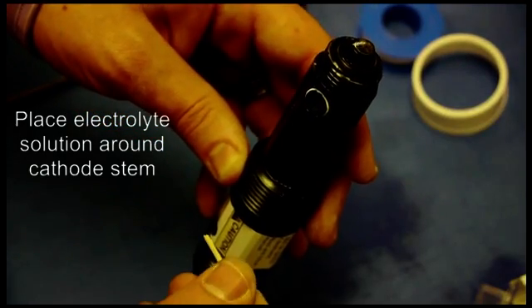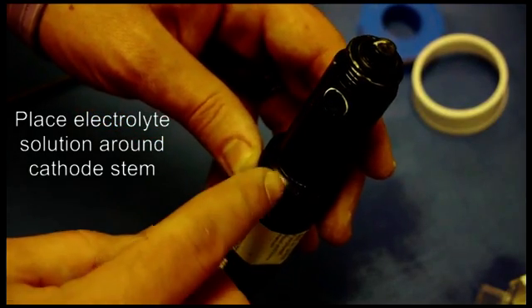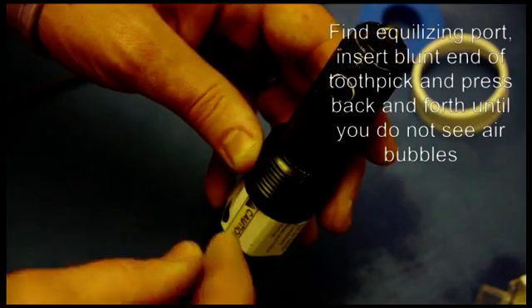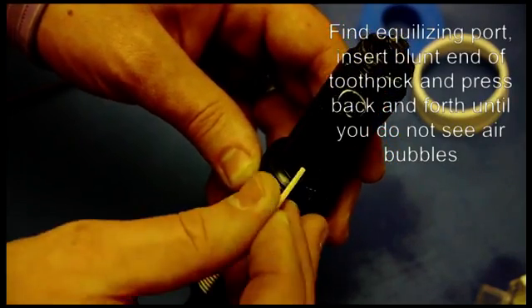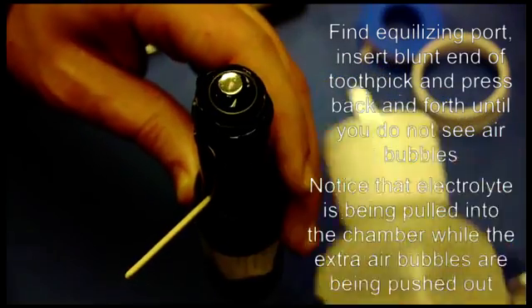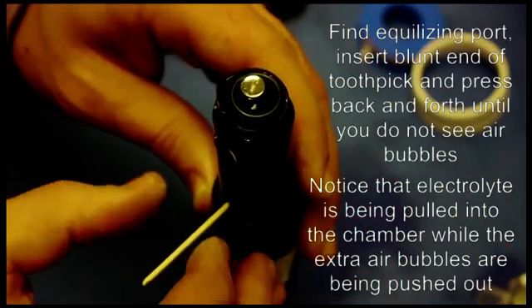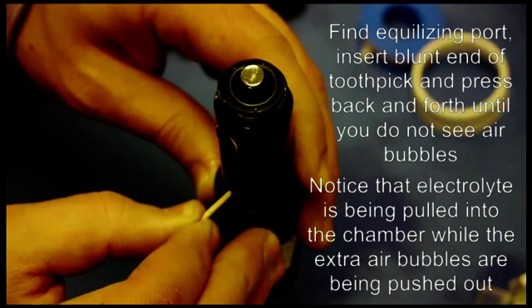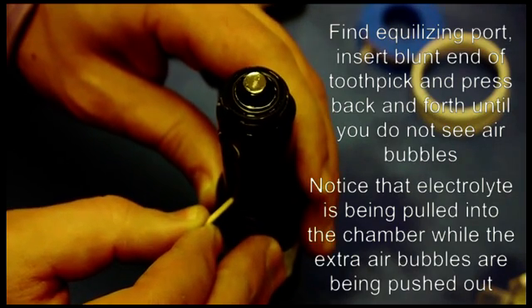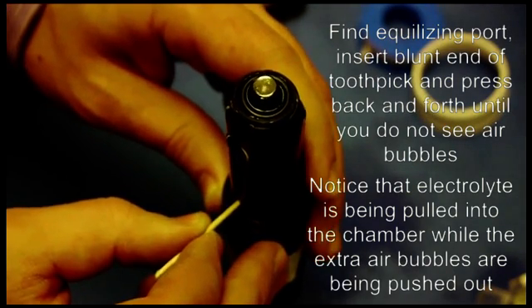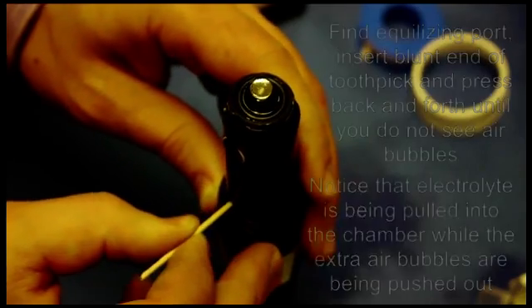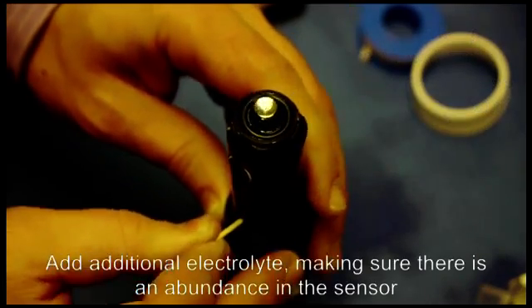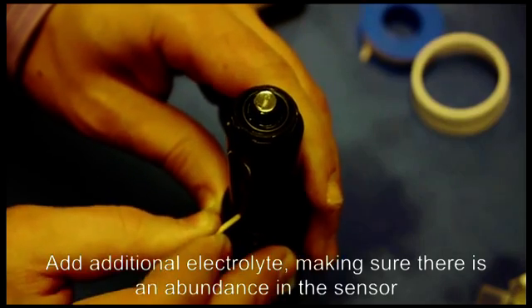Next you're going to want to find the pressure equalizing port which is a small little hole above the threads. Take the flat end of your toothpick and place it inside. Fill the solution on top of the cathode and then press in to the equalizing port and see how I'm pushing the air out and it's getting replaced with the electrolyte solution. That's what we want. I'm going to do this several times until no more solution is left.